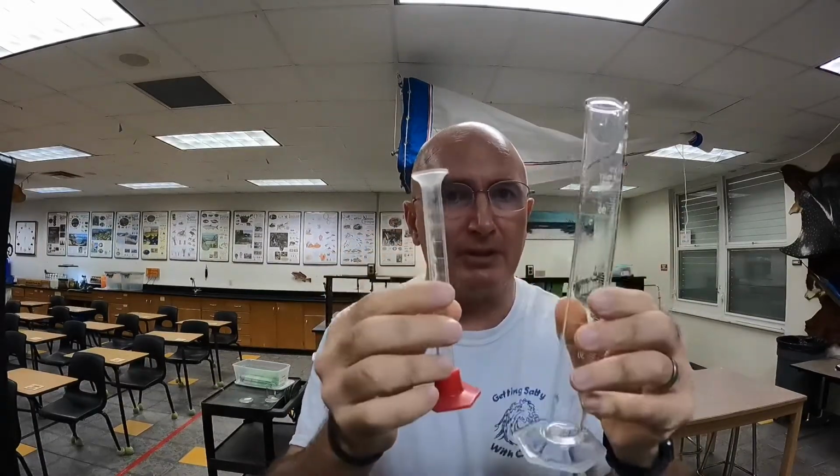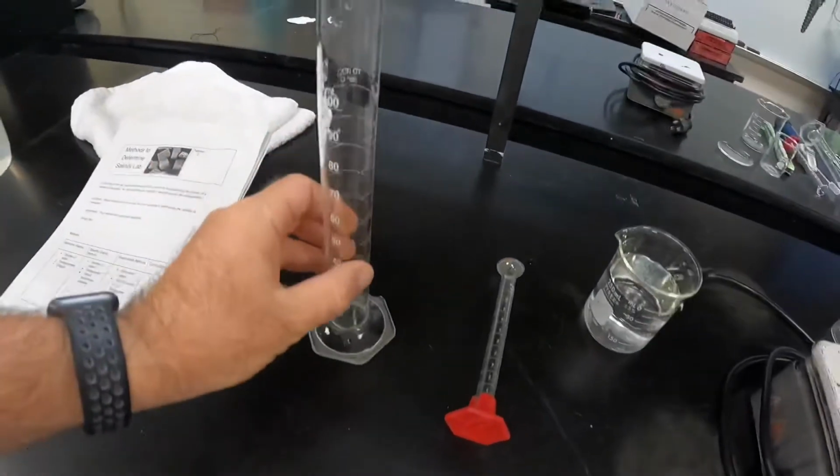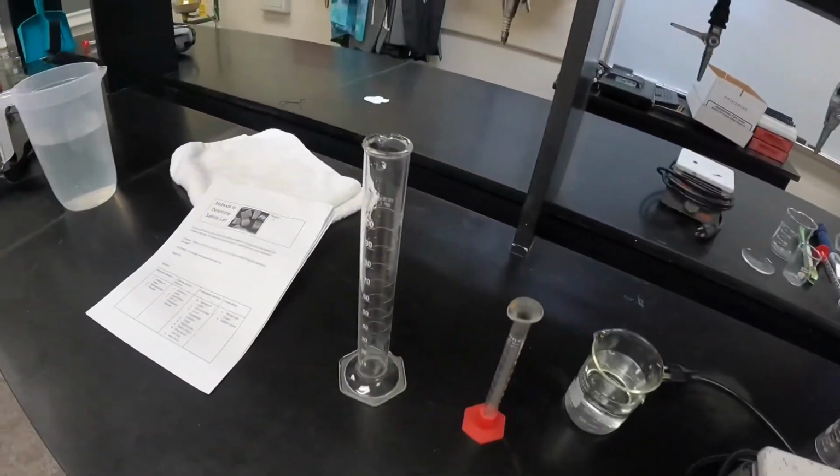After you have those 2 values, if you scroll all the way down in the lab, you'll see a couple charts. You find the hydrometer reading, you find the temperature reading, and where those 2 come together, you can figure out the salinity of the water. At this point, you're done using your graduated cylinders. Whenever you're not using a graduated cylinder, it should not be sitting up on the lab counter, it should be laying down. Like that, not like this.